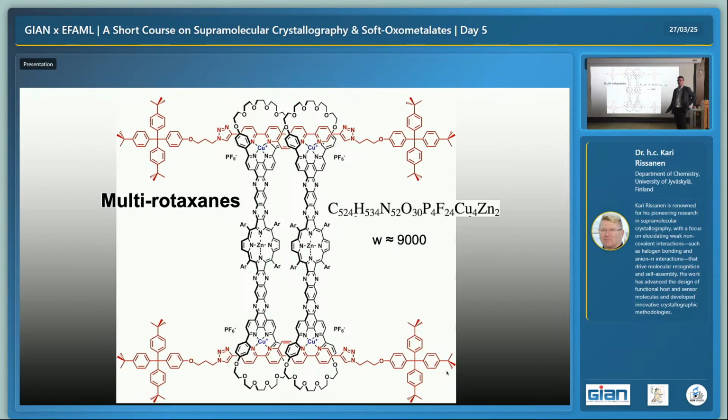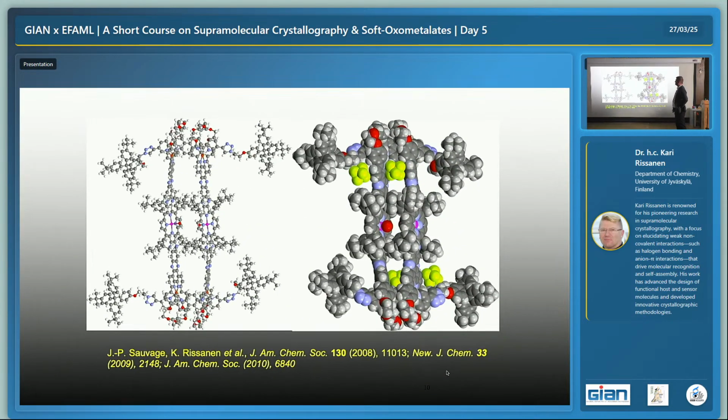That was not done. So actually, we were able to do this with our in-house instrument. And now this is the X-ray structure of that. Here you can see the ideas. It's curved a bit in this direction, so in here too, and the zincs are there. And we could even see that there is a water molecule attached. So we get more information from this. But that was really the idea.